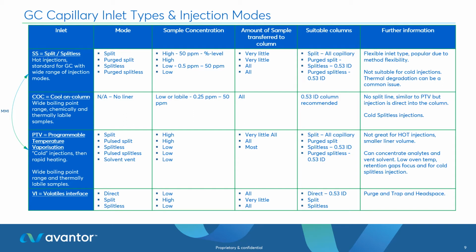There are advantages with this technique. The ability to control the inlet temperature and therefore the sample volatilization is incredibly important for removing any degree of discrimination within the sample. It can also be used with initially quite low temperatures, which again may be quite beneficial. There are also other types of interfaces that allow for a volatile component, a volatile gas, to be introduced into the GC directly.